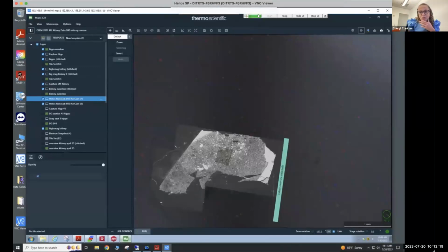I wanted to show the 2D as well, because we have some examples with the reporter that I wanted to show all of you. If you don't have a 3D technology, because some people don't have volume scope, they don't have FIB-SEM, you can still show CLEM just using a 2D SEM. If you have your SEM or your TEM, you can do anything like that, okay? So sorry about my little issue.